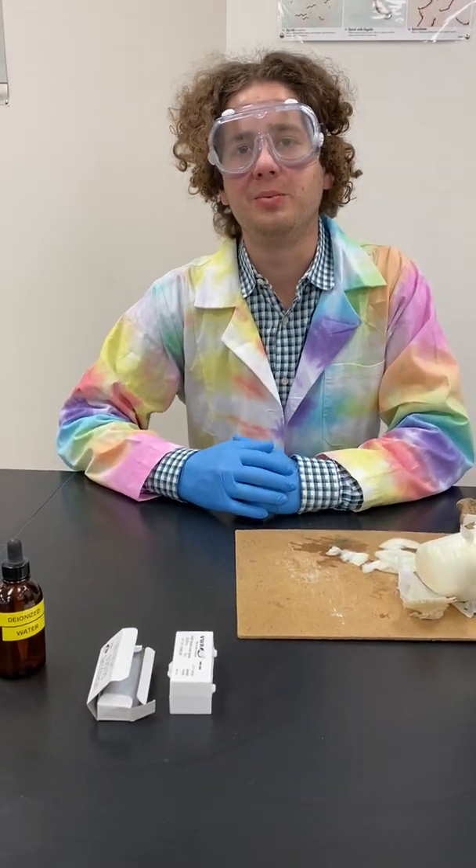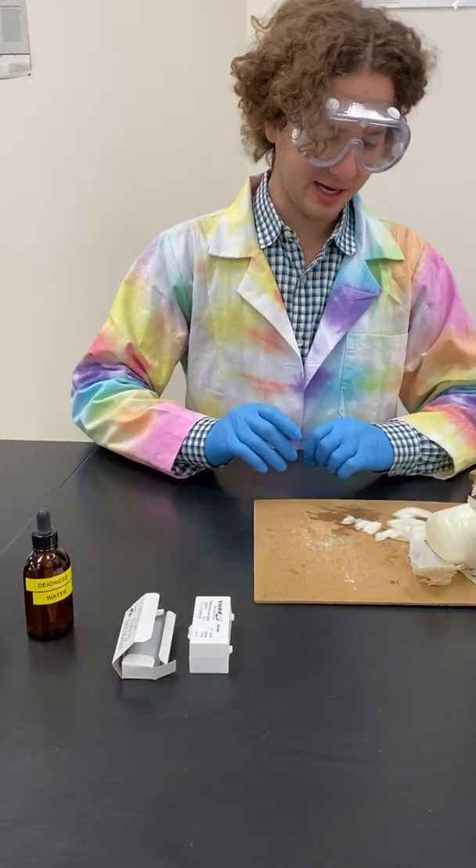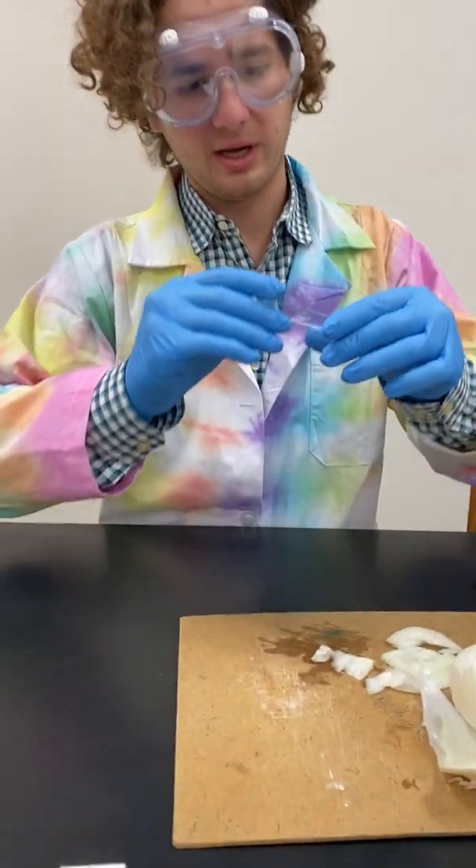Good morning. Today we'll be going over how to use a microscope and prepare a slide. To start, let's prepare a slide.